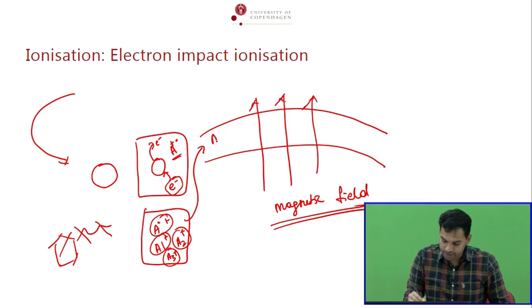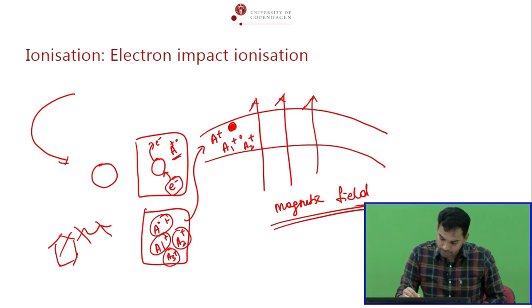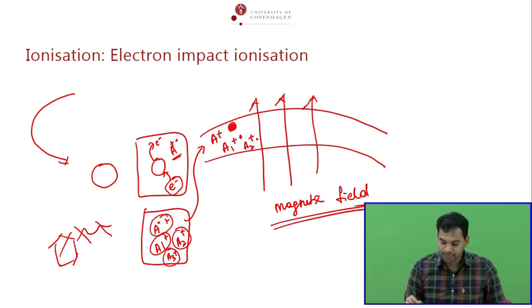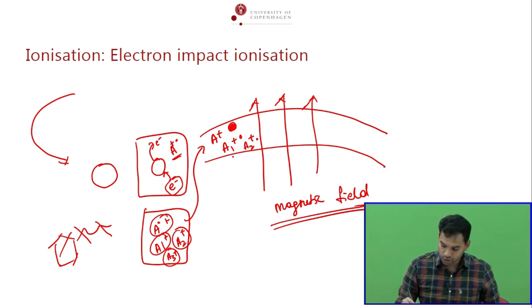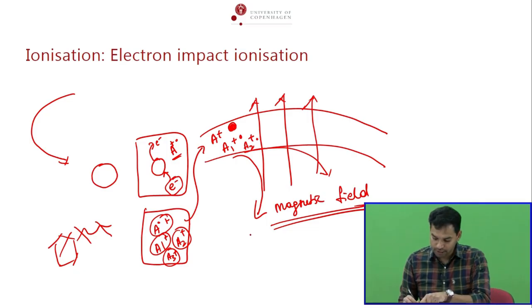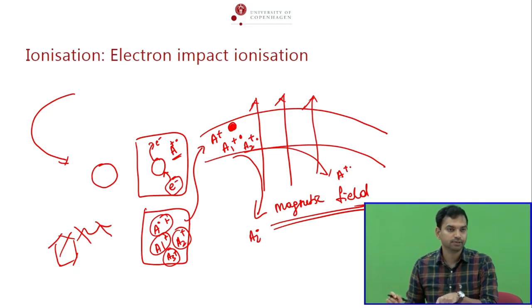Now, we have ions coming, which is A1 plus and let's say A2 plus. Now, A1 plus is a bigger size, A2 is second big, and then your smallest one is A3, imagine, like this, right? And they deflect under the magnetic field in different ratios because they have a different mass by charge ratio, okay? Usually, the smallest one deflects much easier than the biggest one, right? So, basically, the smallest one will deflect more compared to the bigger one, right?